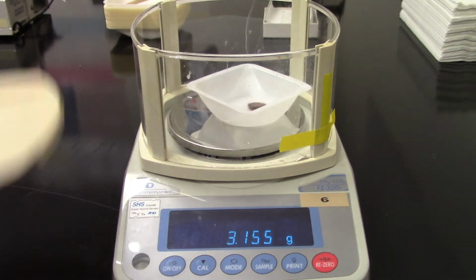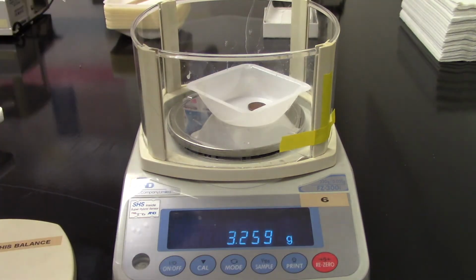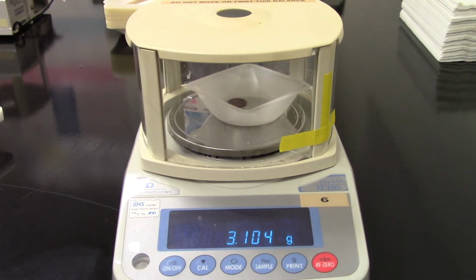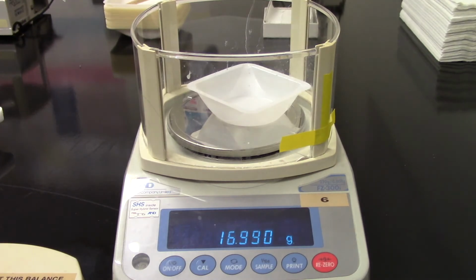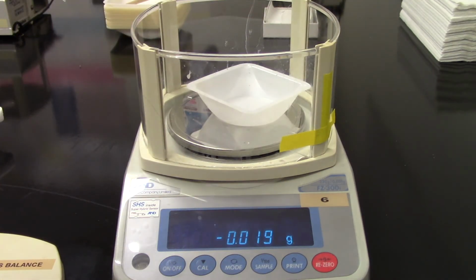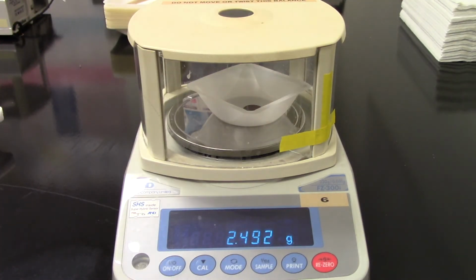The next one is, oops, I didn't read the year off that one, sorry. Let me grab that year for you real quick. This is 1982. And zeroed, good. So this is 1997. And there you go. There's the mass of the last penny.